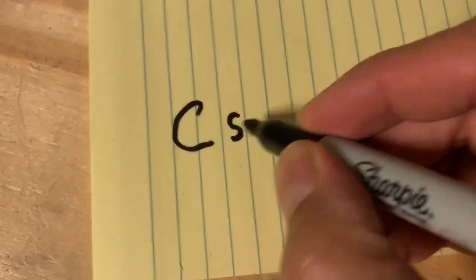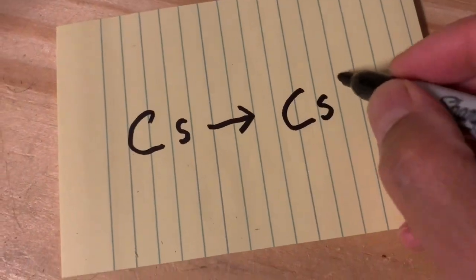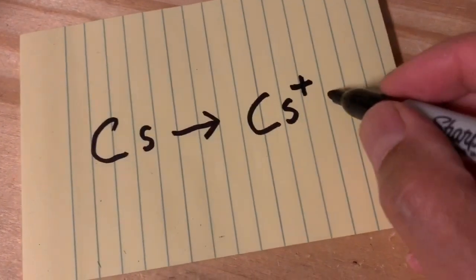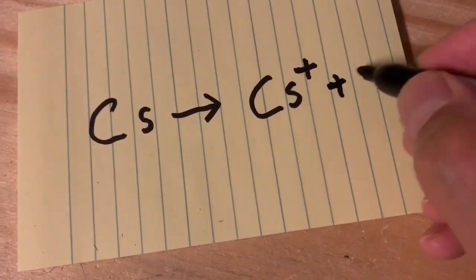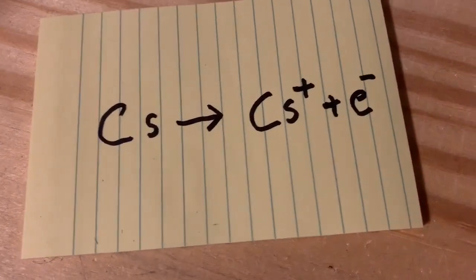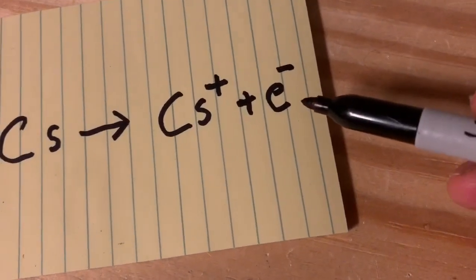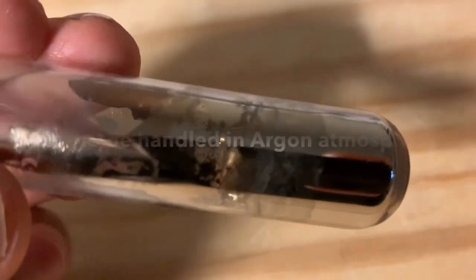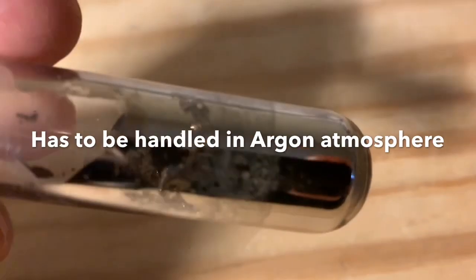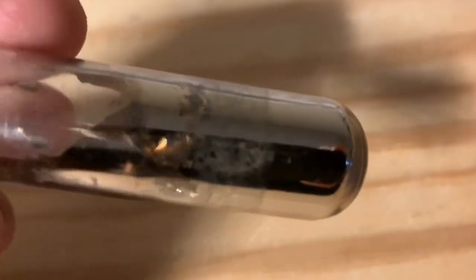Cesium is extremely electropositive, which means that it wants to give up an electron and form a cesium ion. It's so electropositive that it'll push this electron onto just about anything. What I'm going to do is open this vial of cesium and pass oxygen into it to observe. Let's begin.